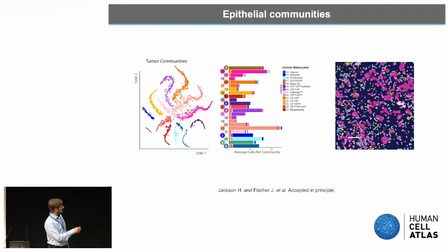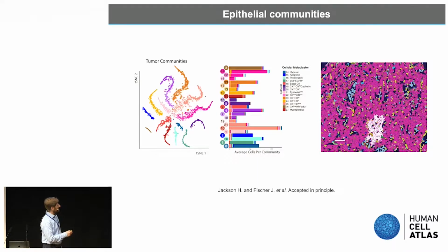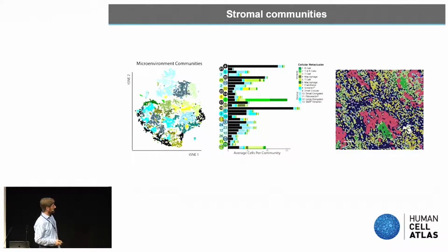And if you look along this axis here, then it actually is related to the number of cells that are found in the community. So here, this is community number 16. You see small communities. Community 22, here you see the patches of the tumor cells are larger. And then in this community 14, the community patches are even larger. So here you have densely populated tumor cell sheets. If you then look at the immune cells, it looks very different because the communities become very heterogeneous.